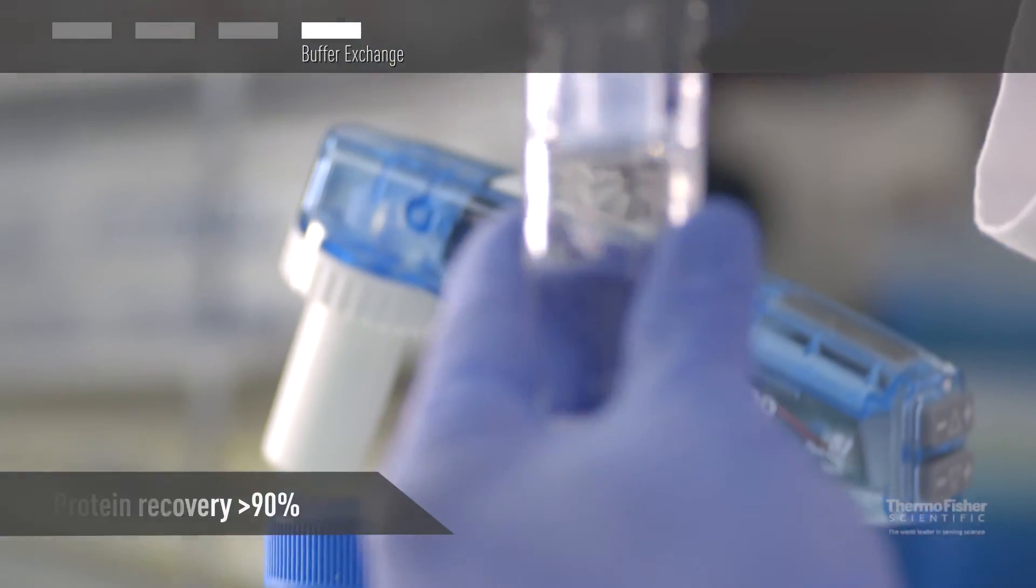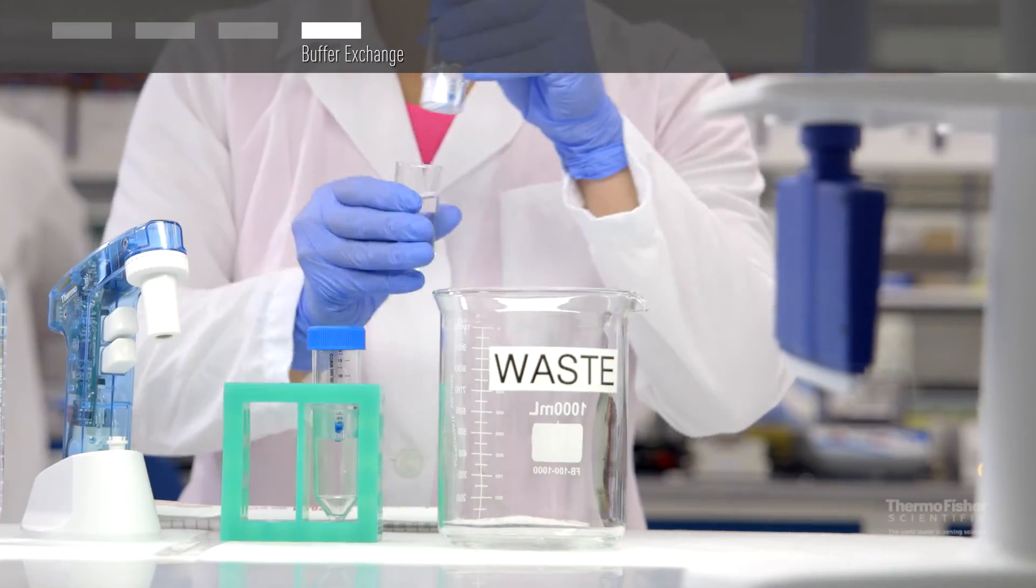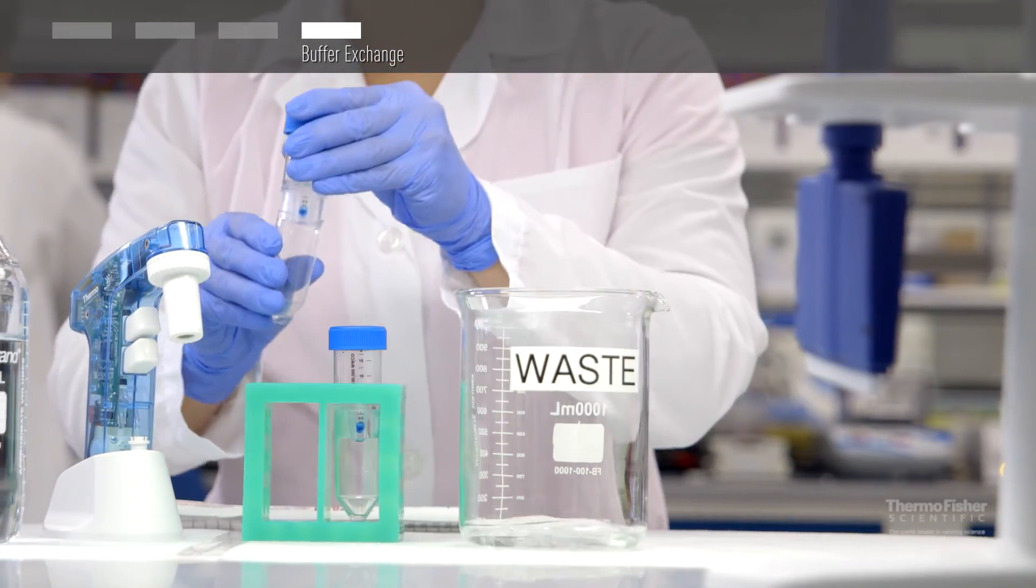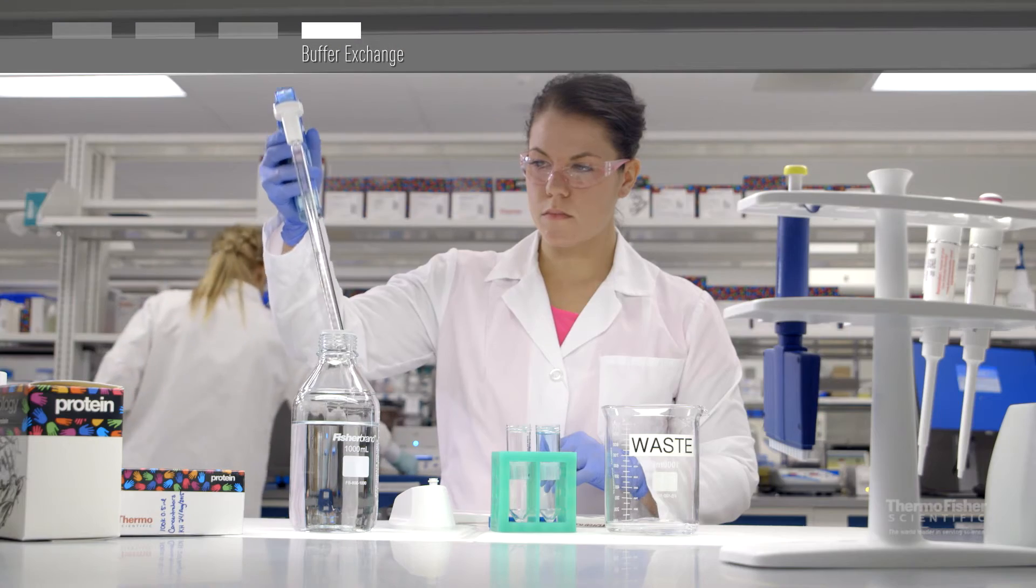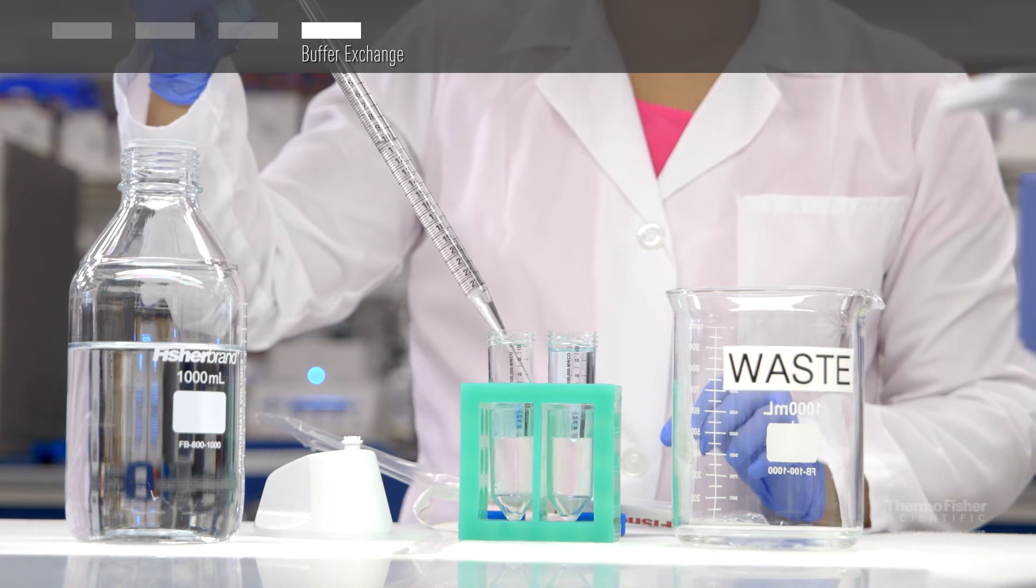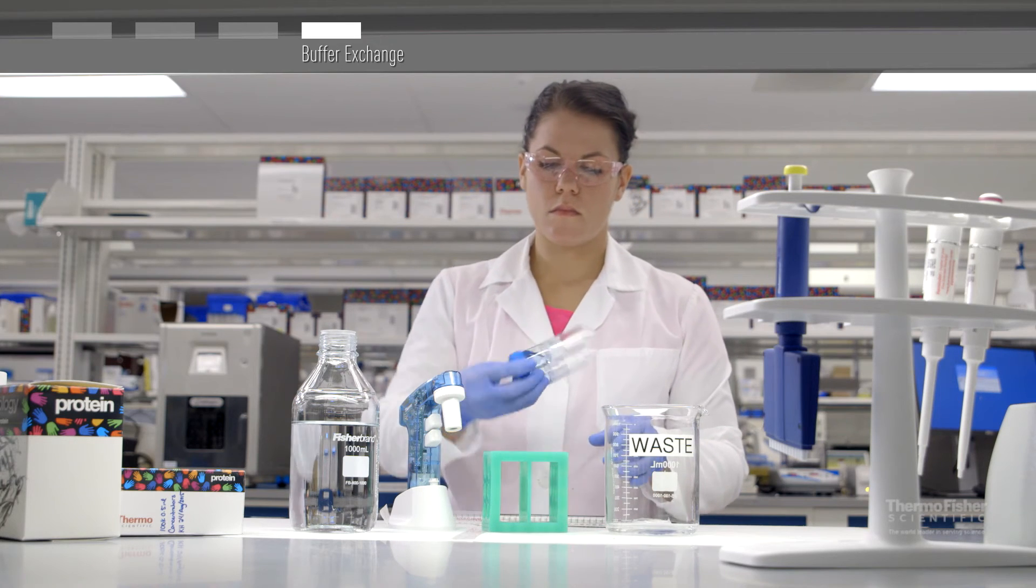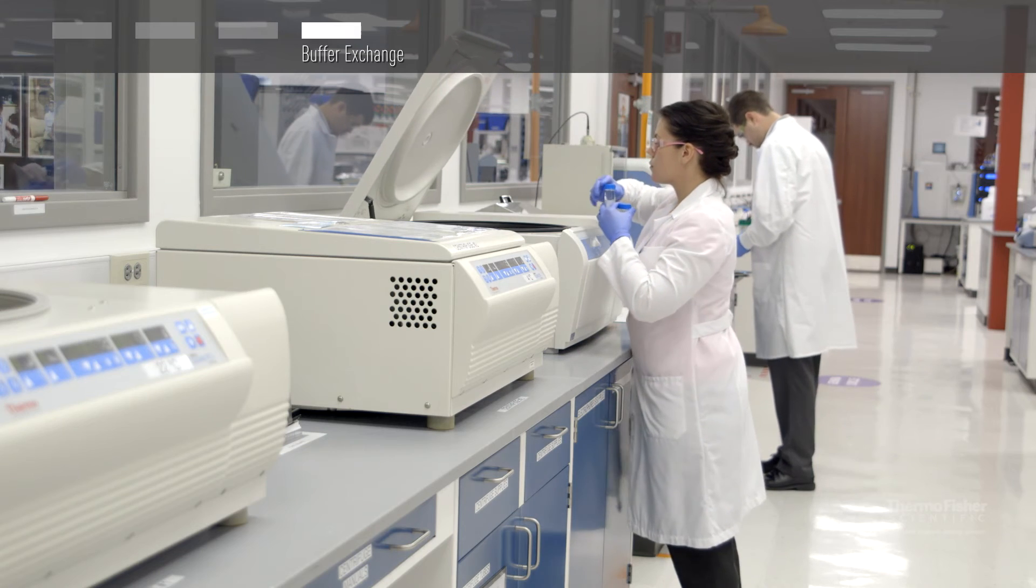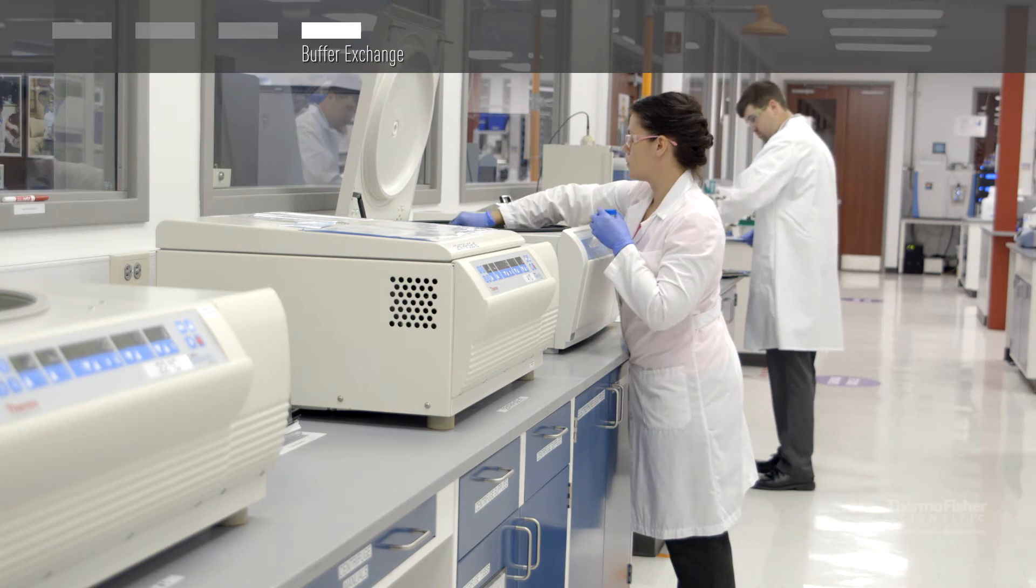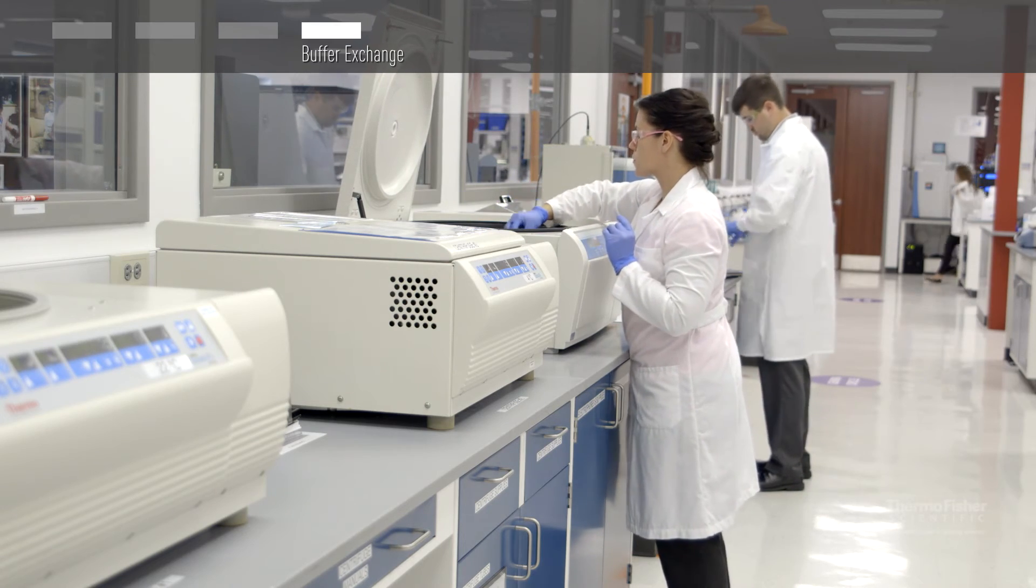If you need to desalt and or buffer exchange your concentrated sample, simply decant the filtrate, reassemble the unit, dilute the retentate to the original volume with exchange buffer, and then cap and mix. Repeat centrifugation followed by addition of exchange buffer until desired solute removal has been achieved.